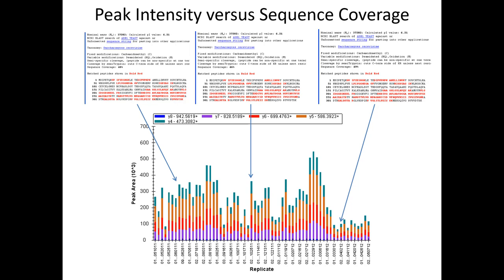But the point is that coverage looks the same in all three of these runs, right? This run has the same kind of peptide coverage, the coverage or the one shown in red, as that one. But this one down here is like 4 times less intense than over here, but it's showing the same kind of detection and coverage of that protein. So there are some things that are not good metrics, particularly if you use them by themselves. If this was coupled with other details, perhaps it could be informative, but in and of itself, protein coverage or sequence coverage is not reflecting any change in the system performance where clearly peak area is.